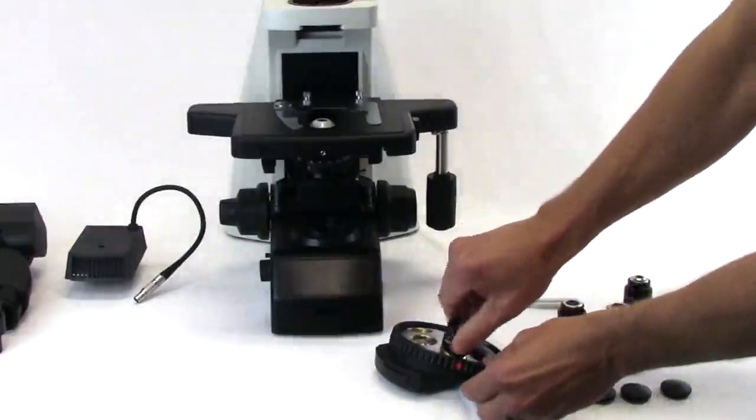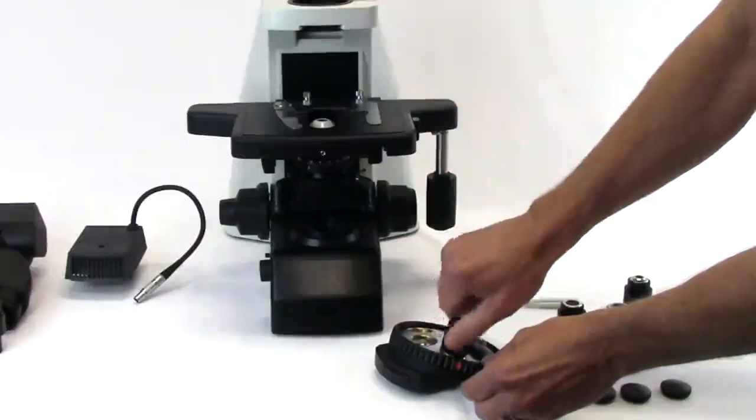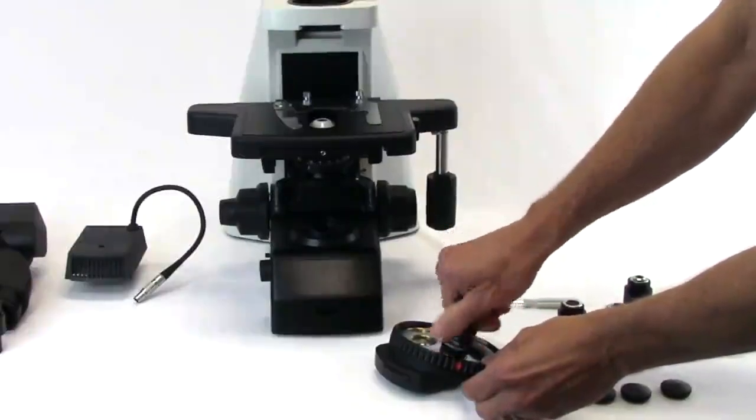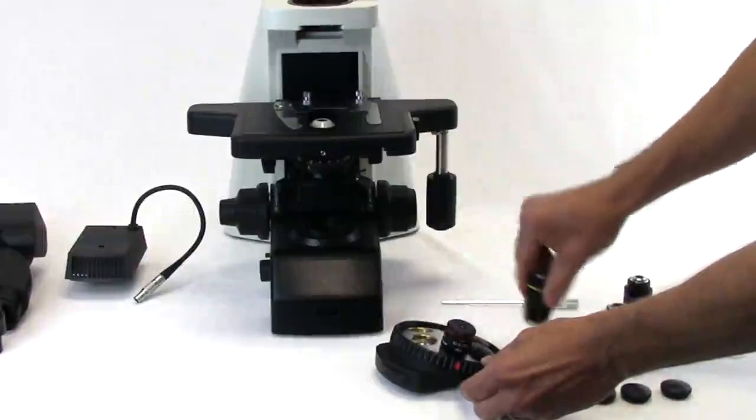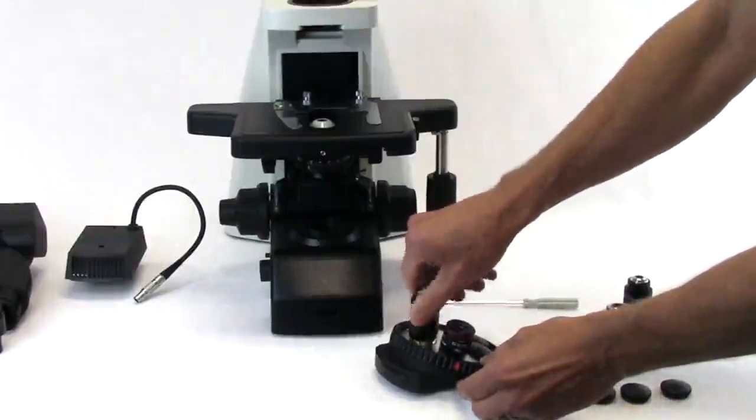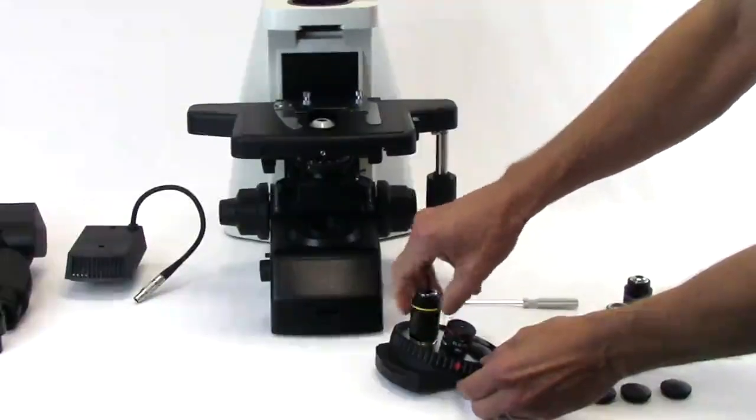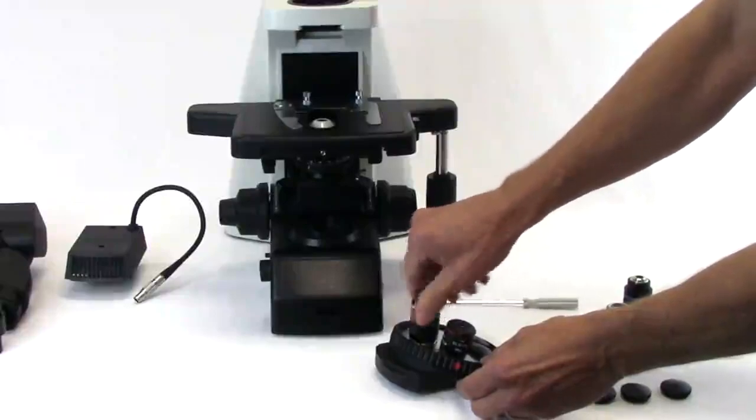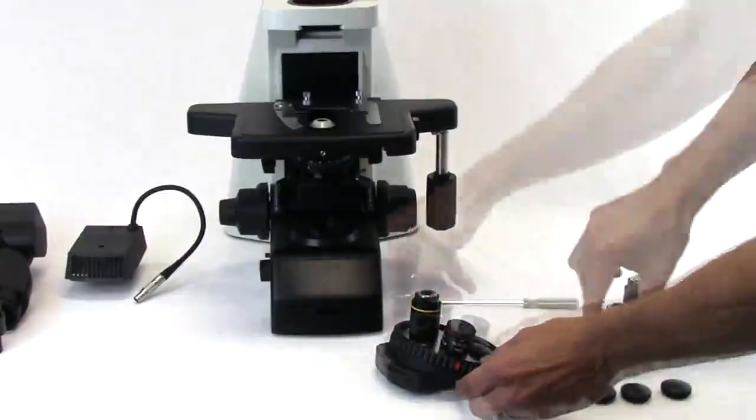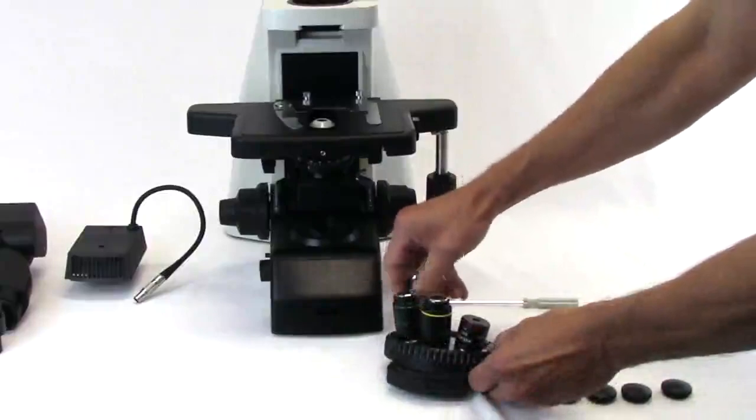Install the objectives into the nose piece from the lowest magnification to the highest in a clockwise direction, beginning with the first empty objective receptacle as indicated by the red dot. Gently screw in each objective in a clockwise direction into the threads of the nose piece receptacle.